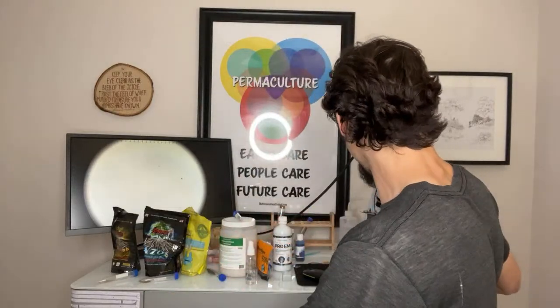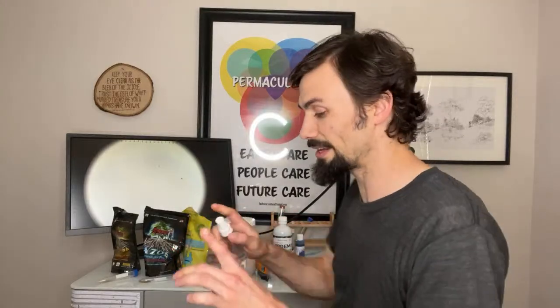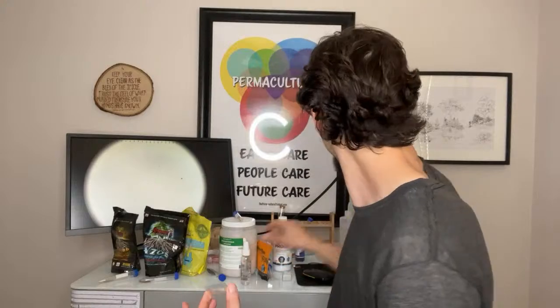But this is basic science. I mean, this is how you figure things out. So this is what we're gonna be doing. And I'm gonna try to be super quick, but I'll tell you why certain things might take a little bit longer. For instance, when we start on our slides, I'm going to clean the slide every single time, and I'm not gonna do it on my pant leg that maybe you've seen other people do. And for optical purposes, I am kind of a stickler.